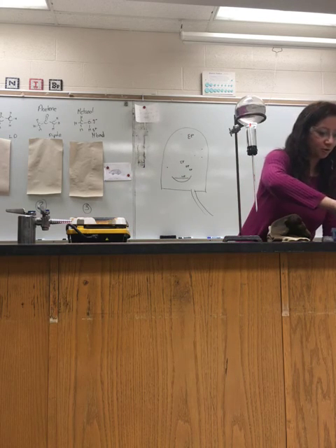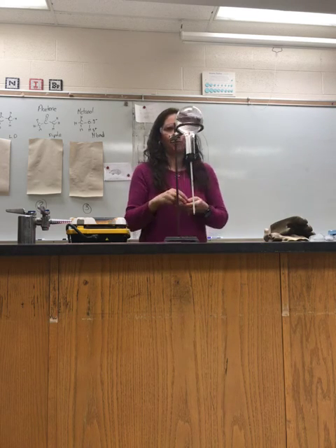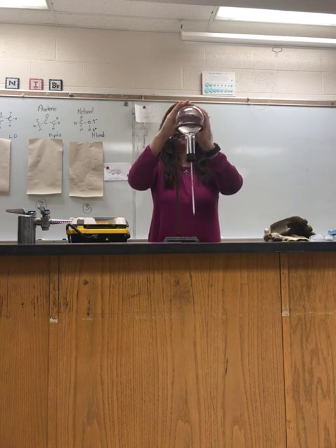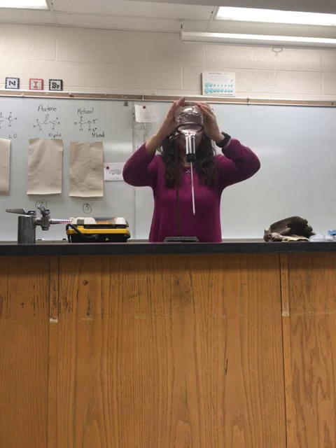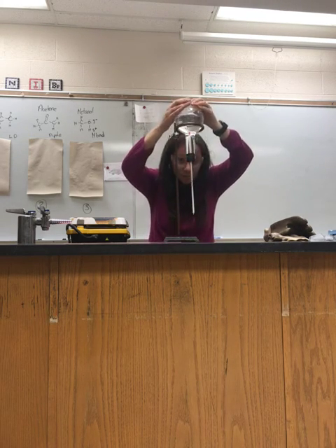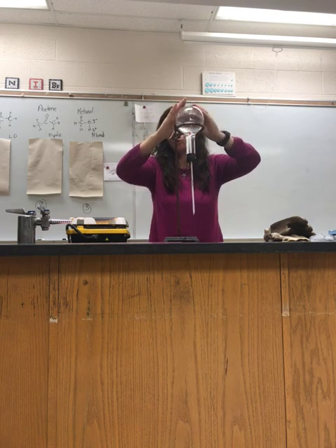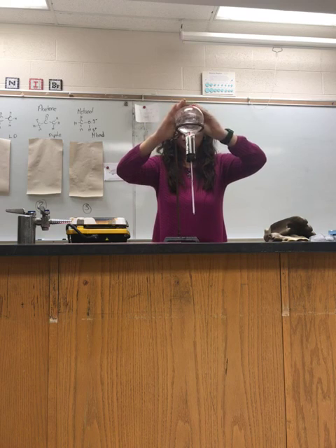And before you go, let's see if we can get this to boil again by applying more ice to it. Yep, it is boiling. And my thermometer says that it is right now at 70 degrees Celsius compared to the normal boiling point, which is 100 degrees Celsius.